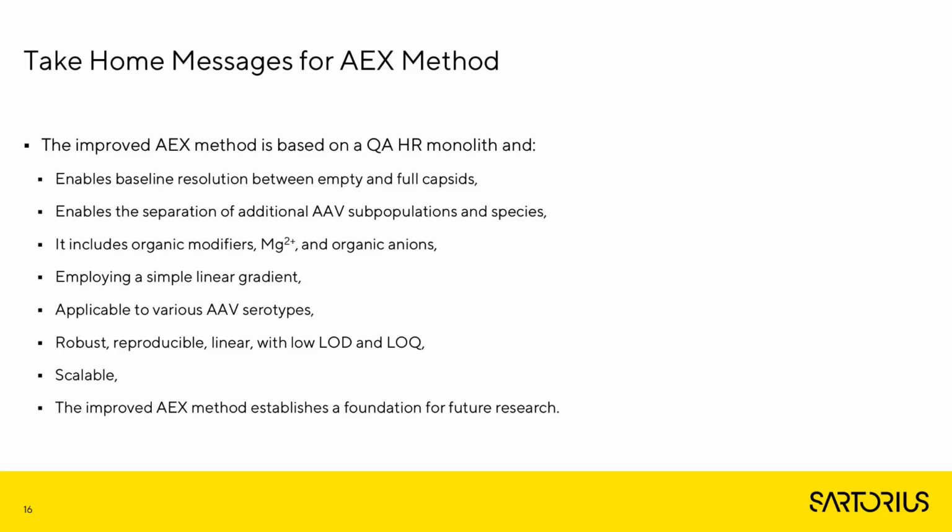The method was developed using organic modifiers, magnesium ions, and organic anions. We applied a simple linear gradient. The method is applicable for various AAV serotypes.